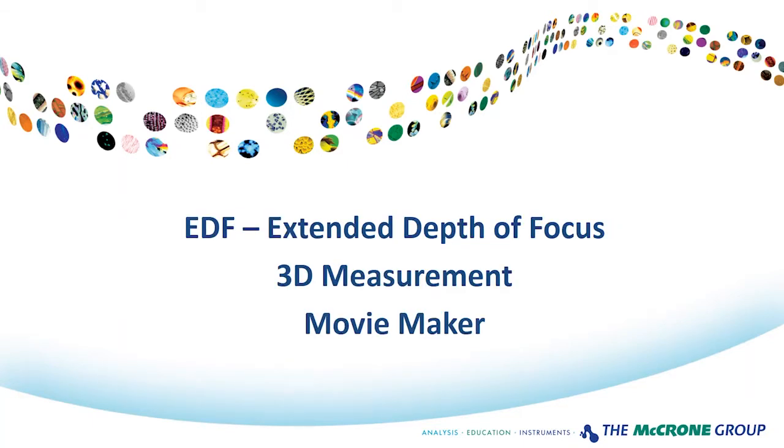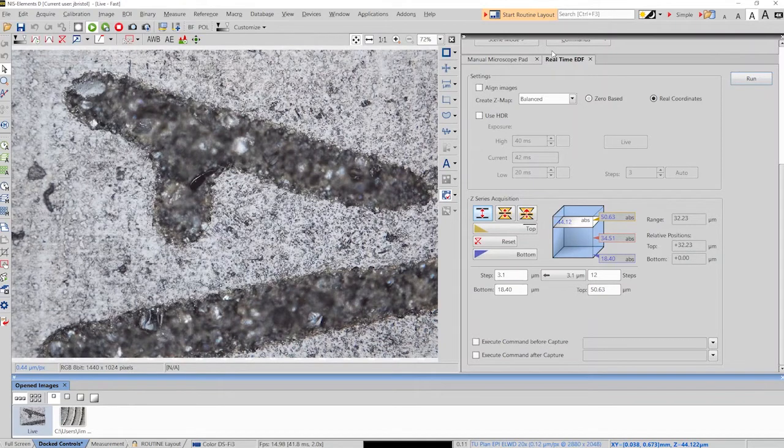Extended depth of focus. The EDF function selects the in-focus area from multiple Z-stack images and produces one all-in-focus image. The composite image can be viewed and rotated as a virtual 3D image as it contains Z-axis information. This Z-axis information allows us to utilize that data set to create, display, and measure in 3 dimensions. And lastly, in this segment, we will show you the Element Movie Maker to display the 3D data set. Extended depth of focus, 3D measurements, and Movie Maker.